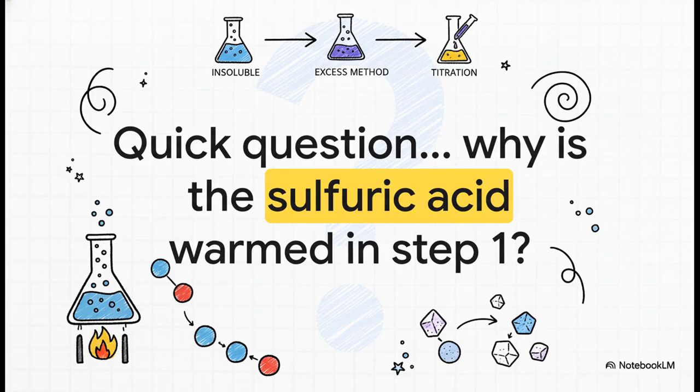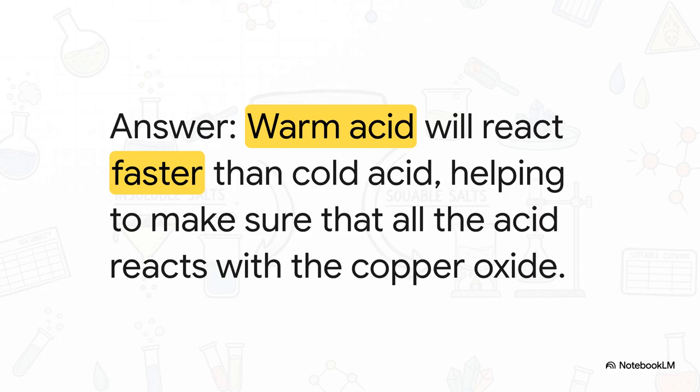No, of course not. There's a really good chemical reason for it. Any thoughts? The answer is all about speed and efficiency. A warmer acid just reacts much, much faster. This makes sure that by the time you add that excess copper oxide, all the acid has definitely reacted. That way, you're left with a pure salt solution after you filter. It's a simple step that really guarantees a better result.